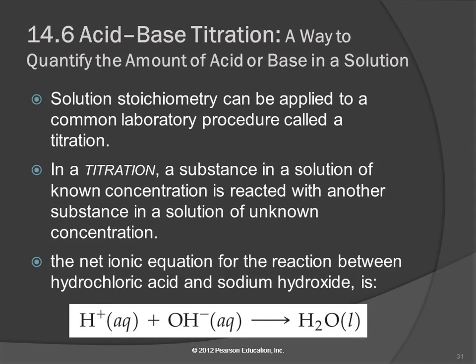Acid-base titration. Okay? Titration is a method, a laboratory method of determining the amount of acid or base in a solution. And it uses solution stoichiometry, which we just learned about.